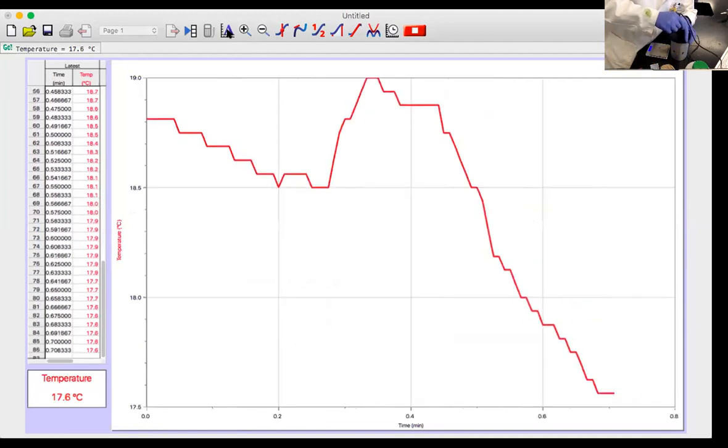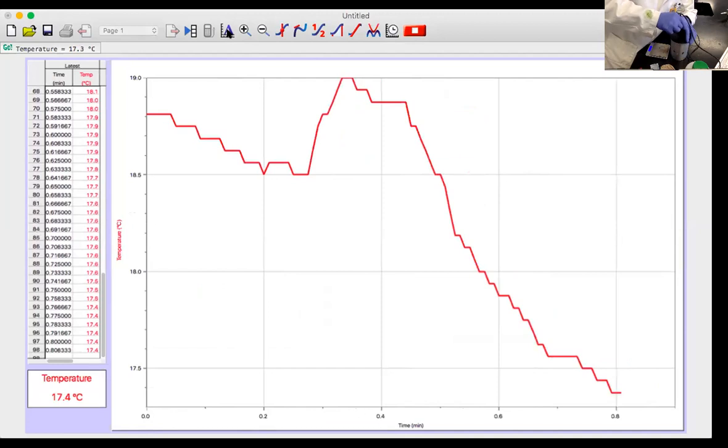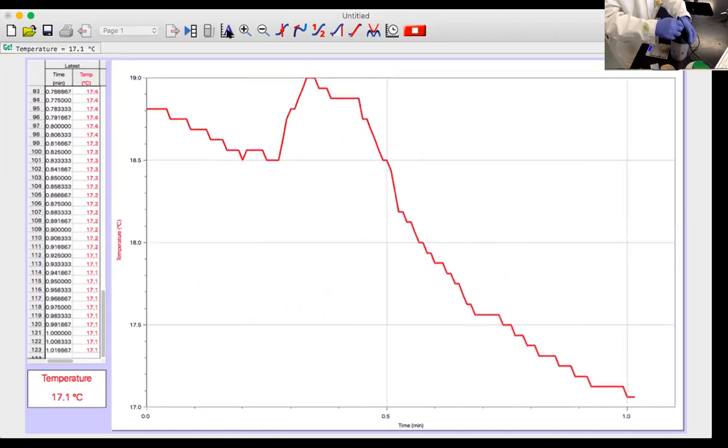See the temperature dropping pretty significantly there. Should find a low point. And it's going down because the energy is negative, remember.